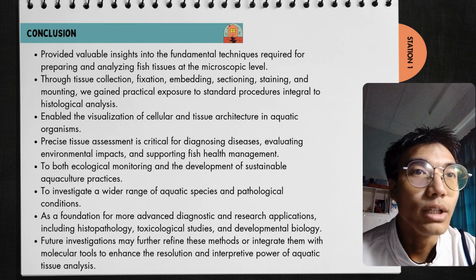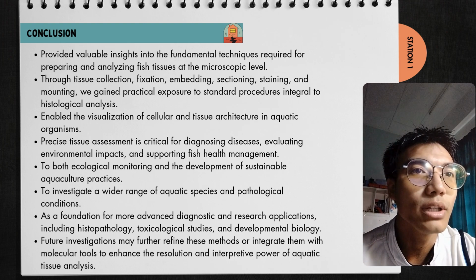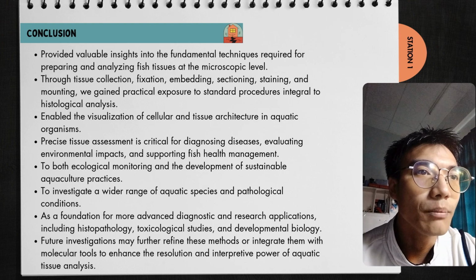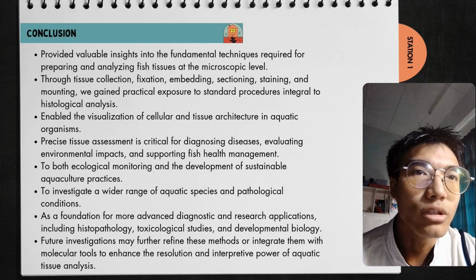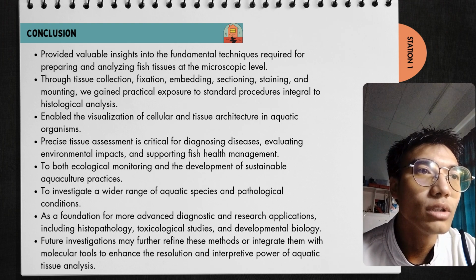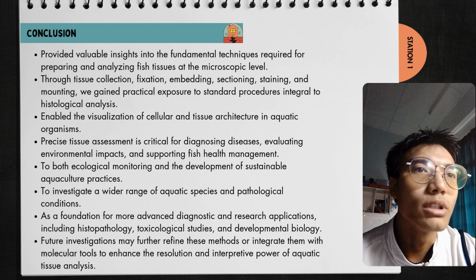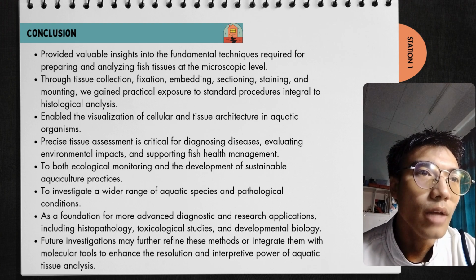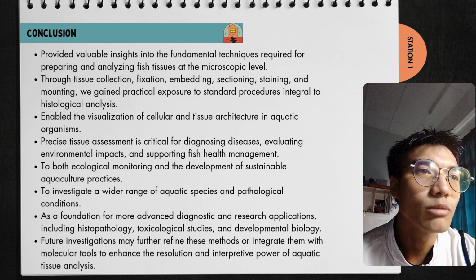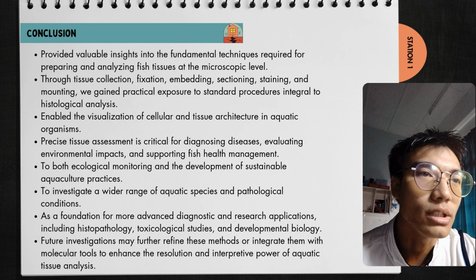For conclusion, this histological mini-project provided valuable insight into the fundamental techniques required for preparing and analyzing fish tissue at the microscopic level through the systematic execution of tissue collection, fixation, embedding, sectioning, staining, and mounting. We gained practical exposure to standard procedures integral to histological analysis.